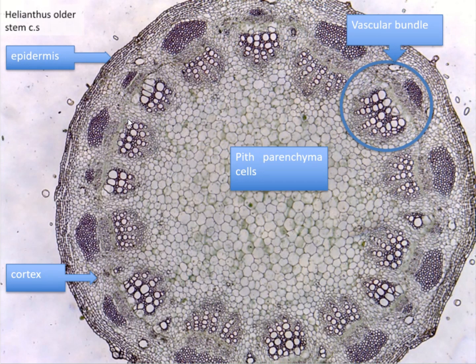First I'm going to start with the epidermis. This is the outermost layer of the plant that provides a key layer of protection against any harmful infections or diseases from killing the plant or making it sick, kind of like the outermost epidermal layer of our skin that protects us. It's the same function in plants.